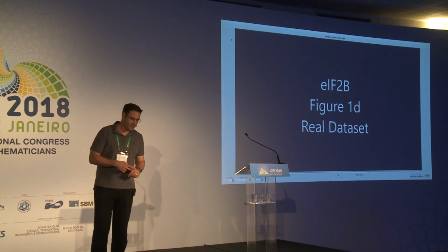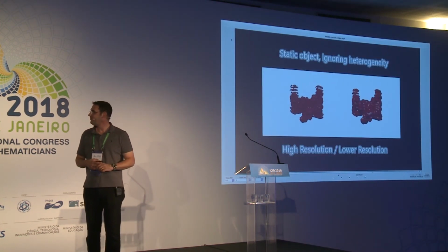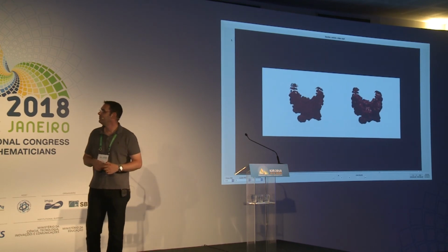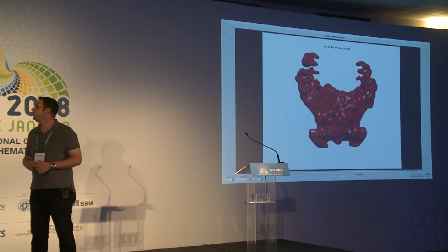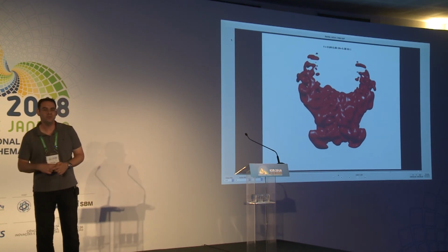And finally, this is the data from UCSF. Again, what you see here are just two reconstructions at high and low resolution that we did. And we're starting to see continuous motion of that molecule.